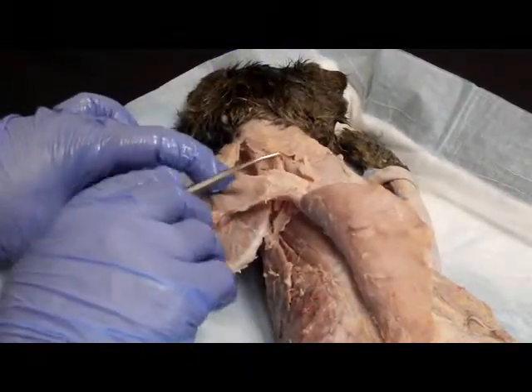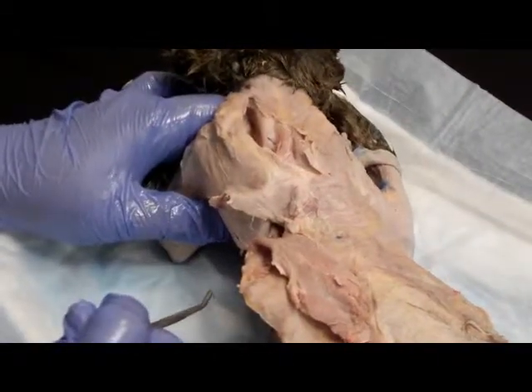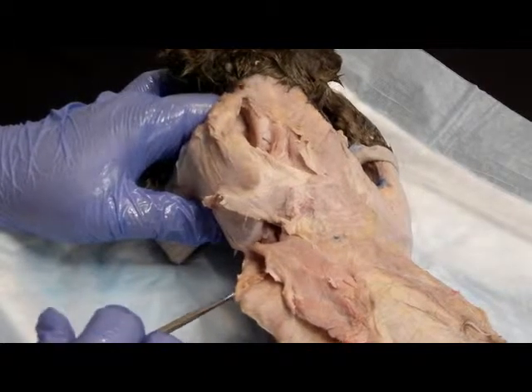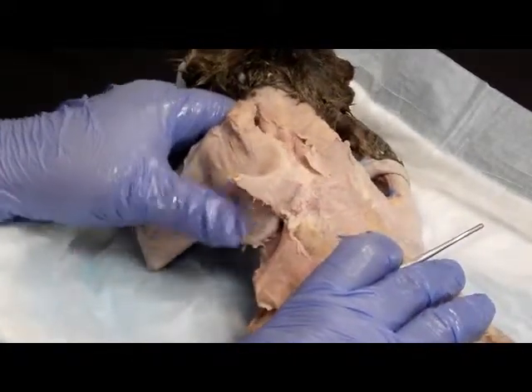The rhomboideus capitis, its origin is the superior nuchal line, its insertion is the scapula near the cranial angle, and its function is to pull the scapula cranially and rotate the scapula.